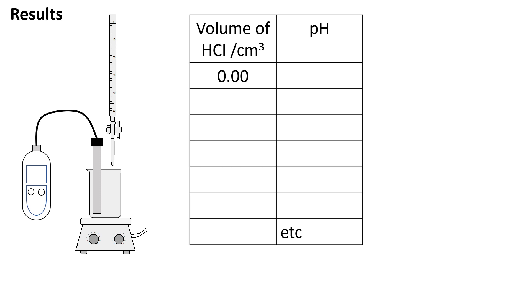Hydrochloric acid is added 1 cm³ at a time from the burette. The volume of HCl is recorded to two decimal places as well as the pH. Continue this process until a total of 50 cm³ of hydrochloric acid has been added.